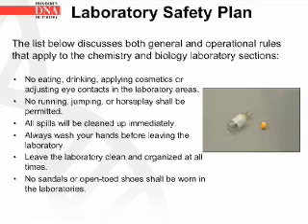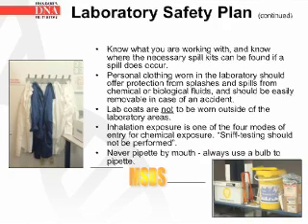No eating, drinking, applying cosmetics, or adjusting eye contacts in the laboratory areas. No running, jumping, or horseplay shall be permitted. All spills will be cleaned up immediately. Always wash your hands before leaving the laboratory. Leave the laboratory clean and organized at all times. No sandals or open-toed shoes shall be worn in the laboratories. Know what you're working with and know where the necessary spill kits can be found if a spill does occur.